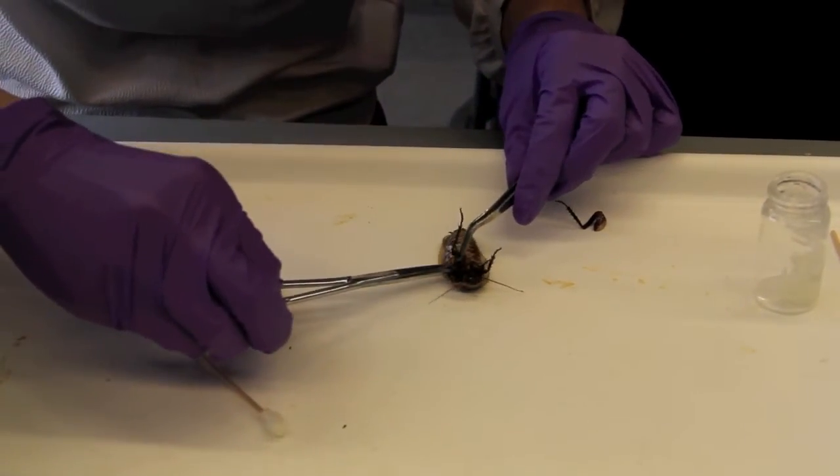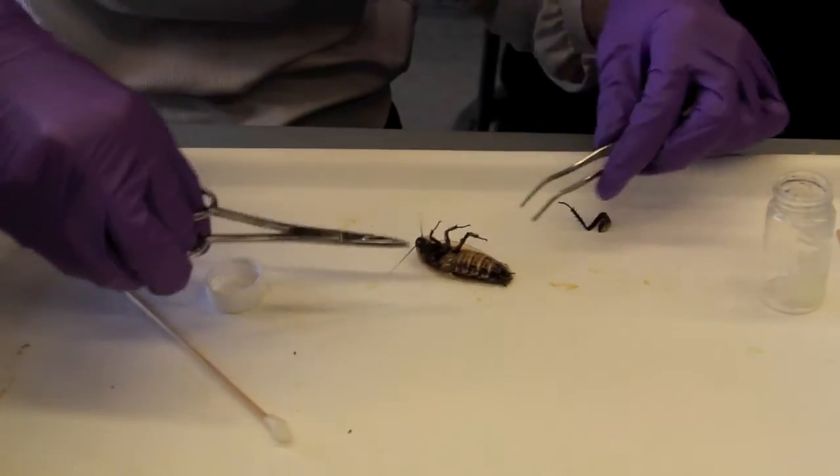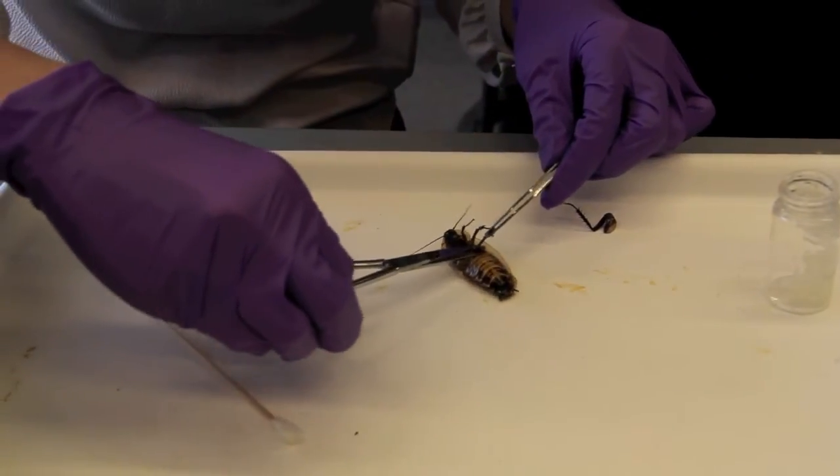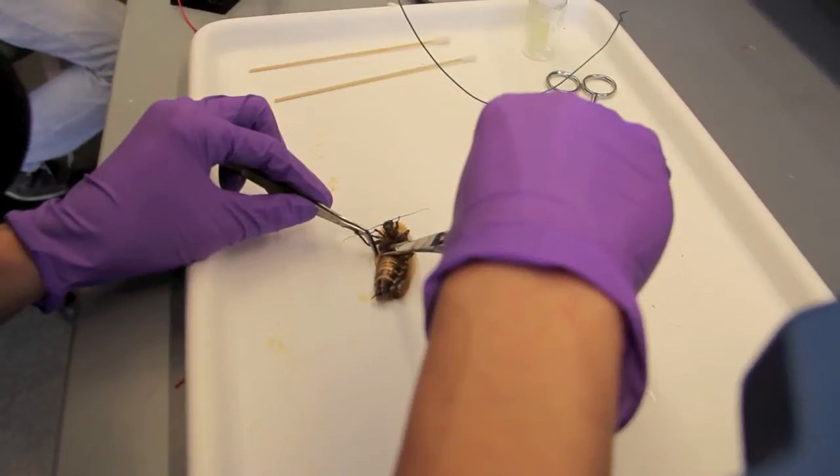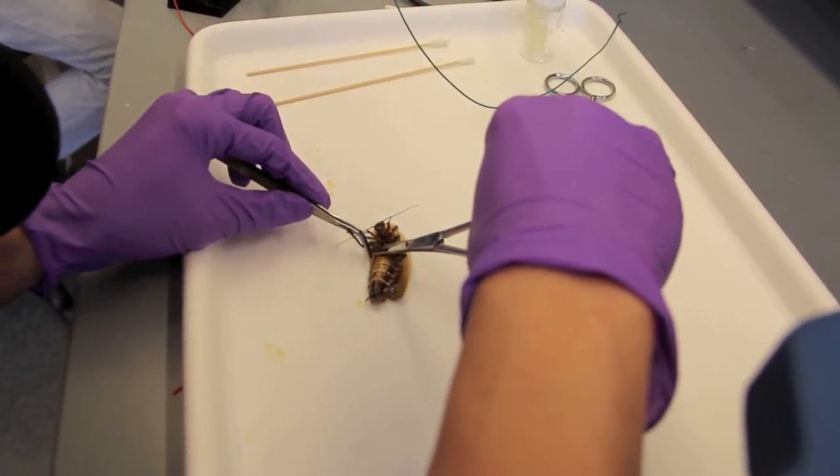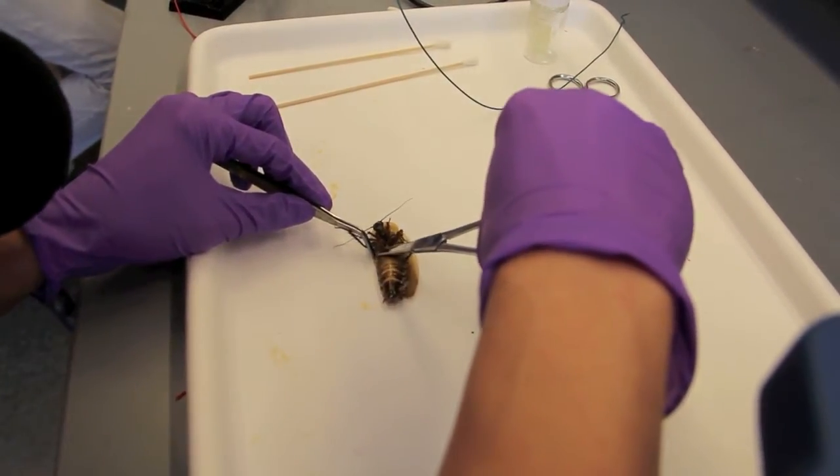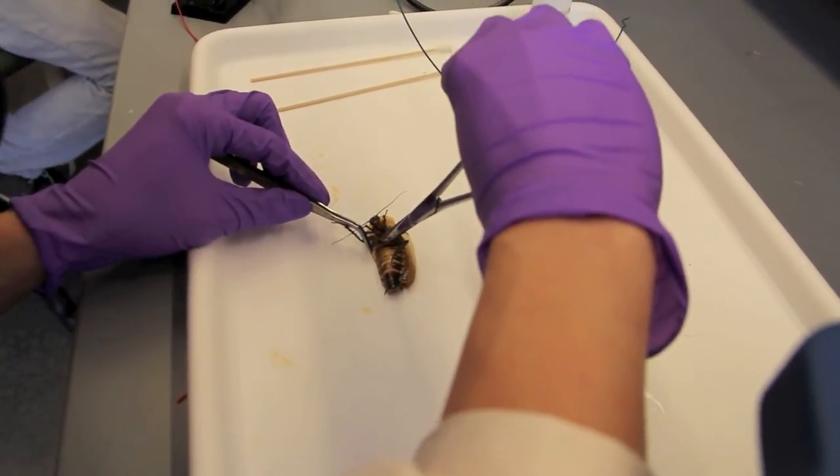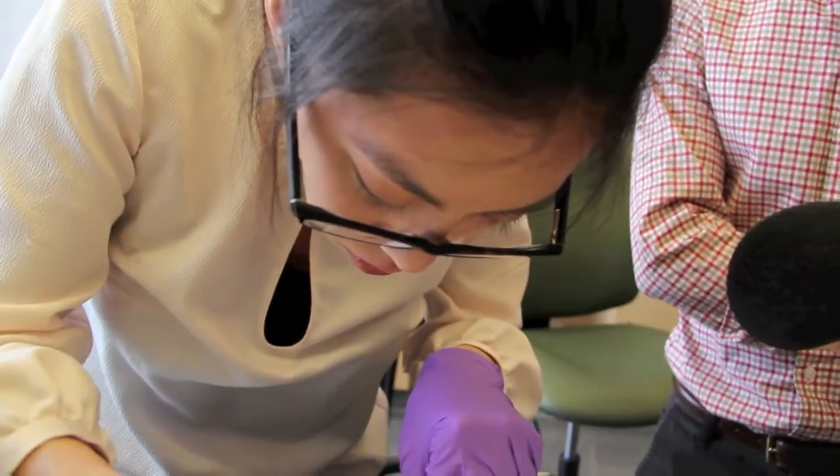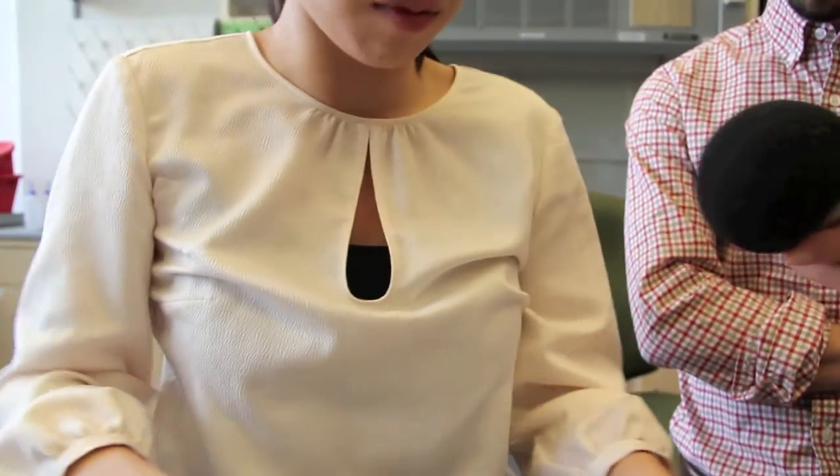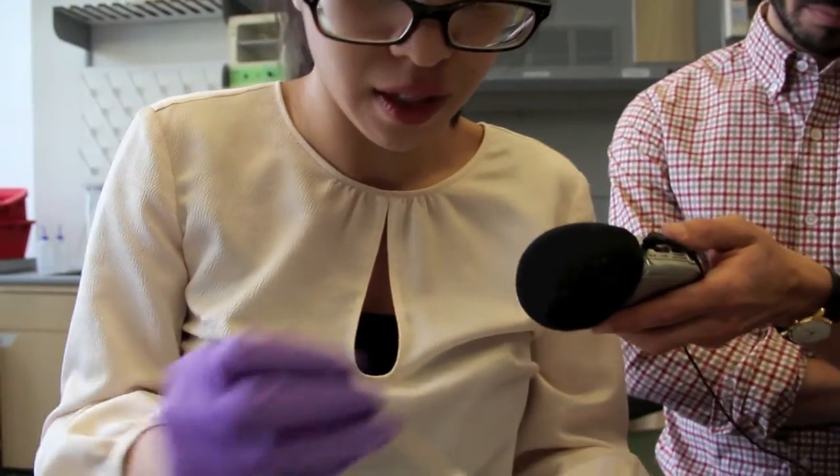We try to work as quickly as we can so the cockroach doesn't come out of its little anesthetized state. Then we're just gonna put him in a plastic bag and put him in the freezer to euthanize him fully.